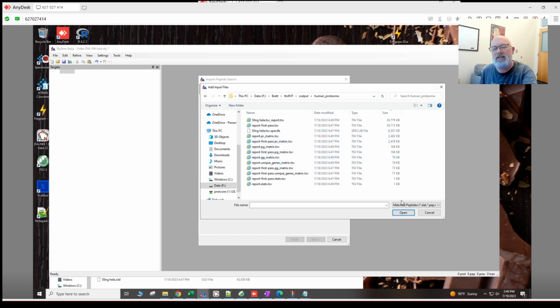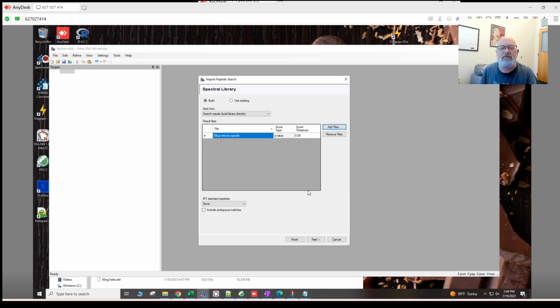I don't know. Oh, it's filtering it away. Okay, so we go to speclib, give it the speclib, iRT. Okay, let's do it. Boom, and it worked. All right, you just have to go to the right directory.